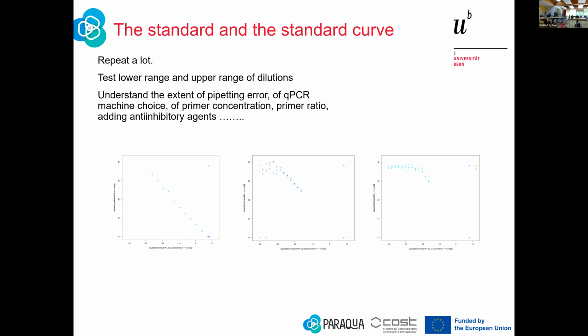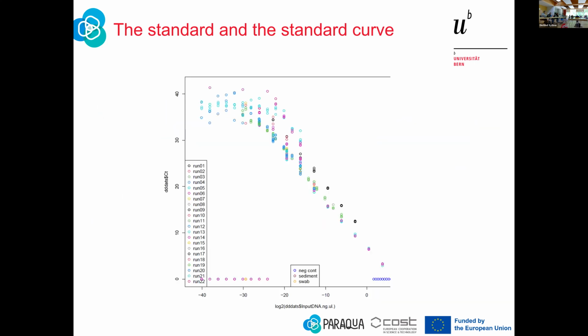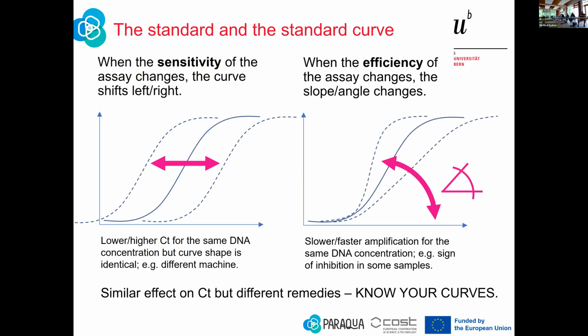Okay, and then you have some of these runs that look like we looked before. Some of them taper off. Some of them you catch a bit more like this, and in the end you will end up with something like this. From many runs, you'll have an overlap of something that looks like this. You can see this is from a student who did 22 runs on different days on different machines. And from this, you can start to play around a bit.